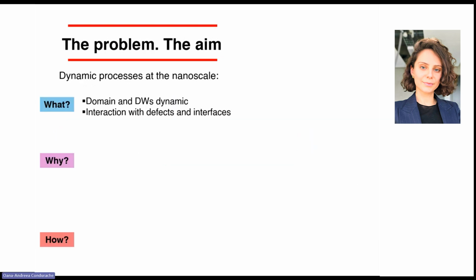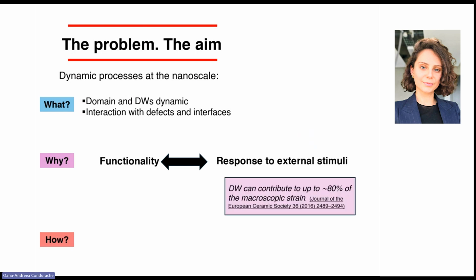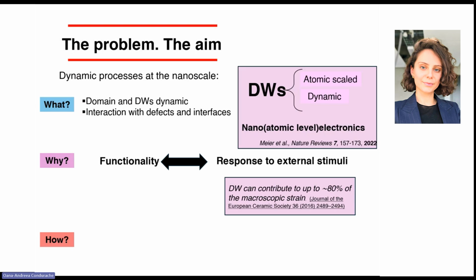And so what I do is I look at the domains and domain wall dynamics and how they interact with other interfaces. As I mentioned before, I do this because their nanoscale response is directly related to their functionality. Just to give you an example, the domain wall dynamics has been shown to contribute up to 80% of the total macroscopic response. And also, domain walls are atomic features which are potentially dynamic, and this is very attractive from the point of view of applications. And a relatively new paradigm has opened up, which is called domain wall nanoelectronics.